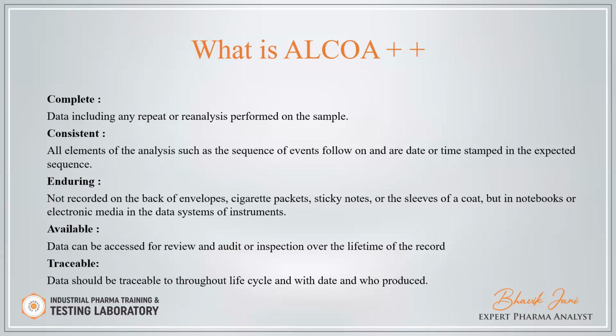It should be sequential filing, consistent, enduring, not recorded on the back of an envelope, cigarette packet, sticky note, or sleeve of the coat. Data should not be recorded in any non-GMP document. Any packet, any box, sticky note, yellow tag, sleeve of the coat, whenever we write in our hand or anything else.